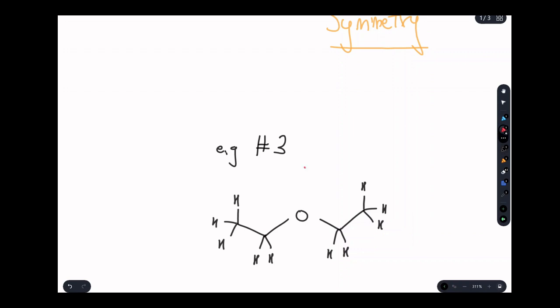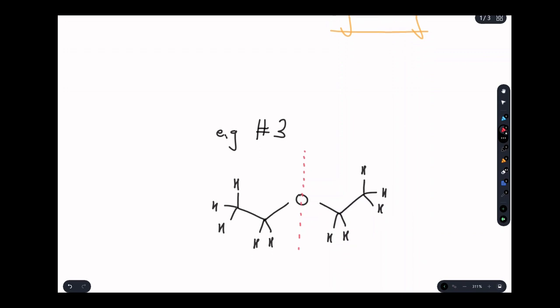Here you'll notice that there is a total plane of symmetry across the molecule. That is, the left side is identical to the right side. If you were to flip it over, you wouldn't change it. So it would make a lot of sense that these 3 hydrogens would be the same due to rotation, and that these 2 would be the same due to rotation, an integration of 3 and 2 respectively.